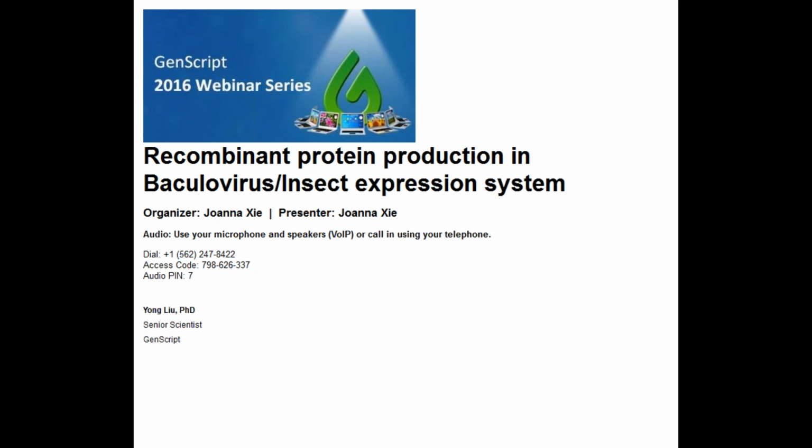Now, having seen that, let's take a look at how we can improve protein production in an insect expression system. First of all, codon optimization is a very useful method to improve protein expression and also decrease the cost of final cell culture. And the concept is pretty simple here. Since not all codons are used equally within a host, the major codons are those that occur in highly expressed proteins, and the rare codons are in genes expressed at lower levels. And when the codon usage of your target protein differs a lot from the average codon usage of the host organism, this could result in decreased expression.